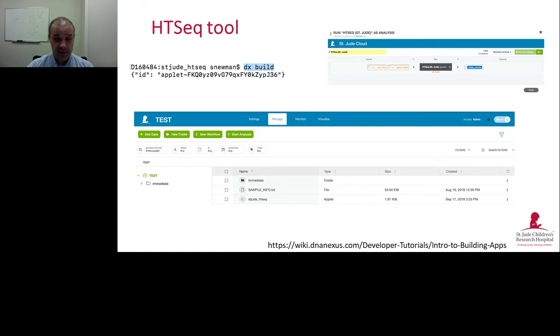You no longer have to program at the command line. All you need to do is to have written the code on the previous page, and that tool is now there for you to use. The added bonus is you can now share that tool with your lab members or collaborators that might be anywhere in the world just by granting them access to your project.